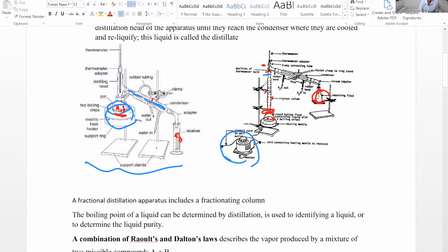When you see in the video, or in face-to-face classes when you are in the lab, the 3-finger clamps have adjustable length and angle, which makes it possible to adjust the height and the length of the clamp.